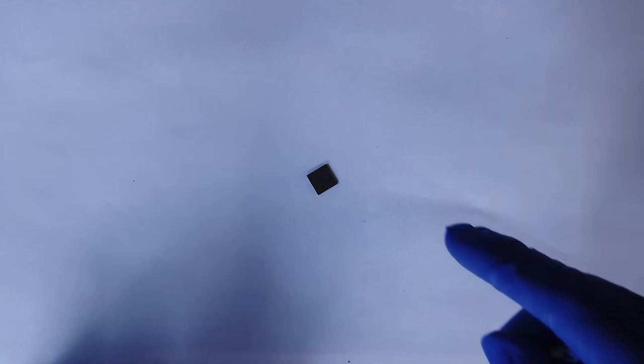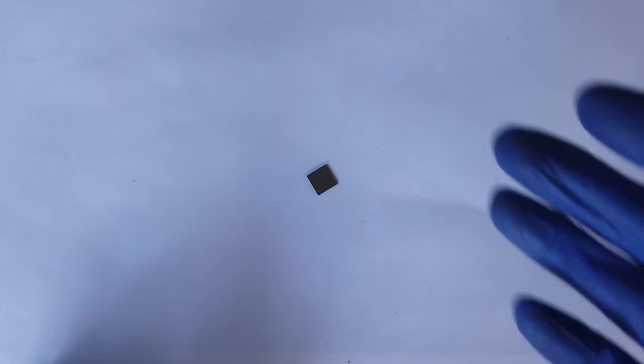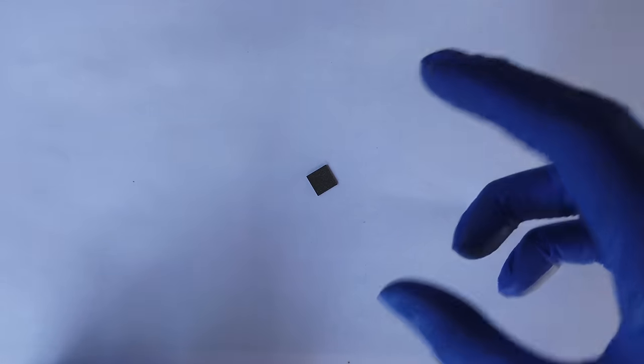Anyway, to the electrochemistry, this is an excellent electrode material with some really impressive properties. We are essentially combining the chemical stability of diamond with electrical conductivity. As you might know, diamond is not very chemically active. In fact I genuinely can't think of any reactions that it would undergo at room temperature. I'm sure someone in the comments will tell me if I'm wrong on that, and in fact we can demonstrate its chemical stability right now.